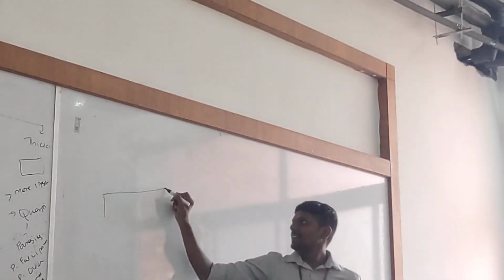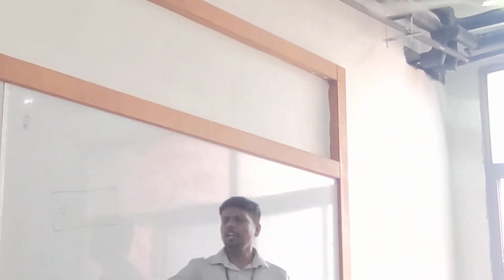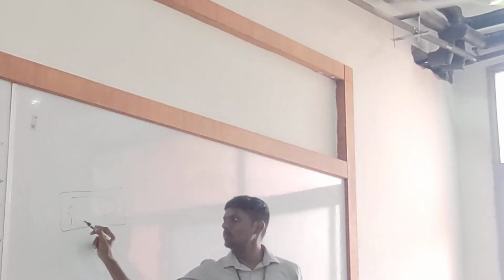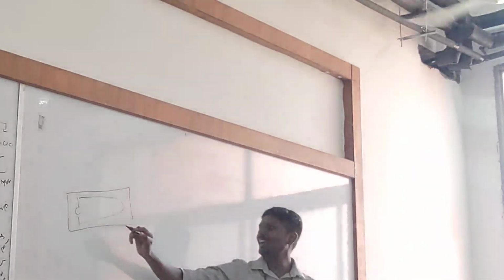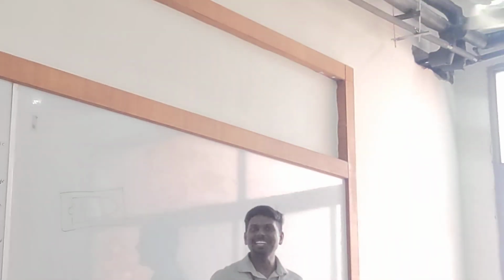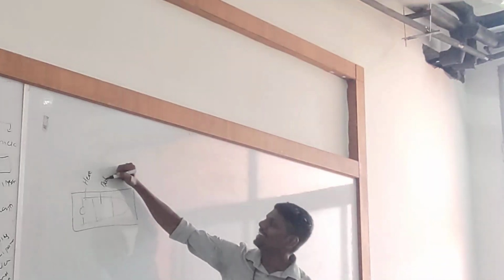First you will take a slide. An ideal good standard thin smear should have the following things. Listen, you kept a drop of blood. Then you spread it. After spreading, you will get a shape like a tongue. Now this has three areas: head, body, and tail.